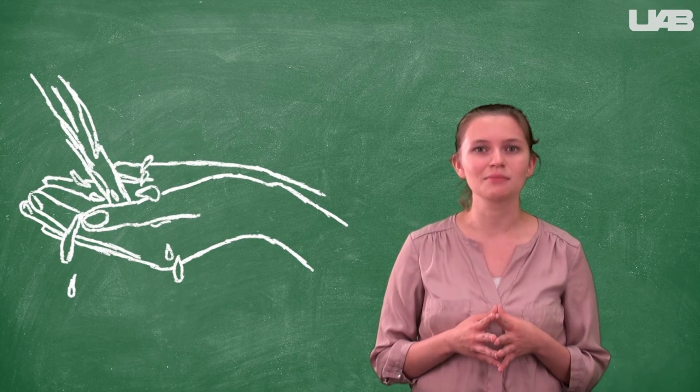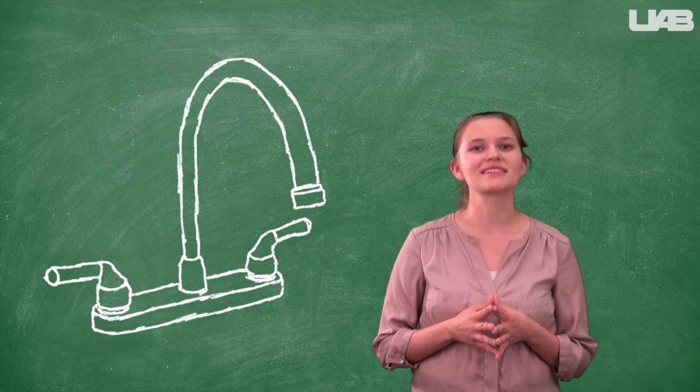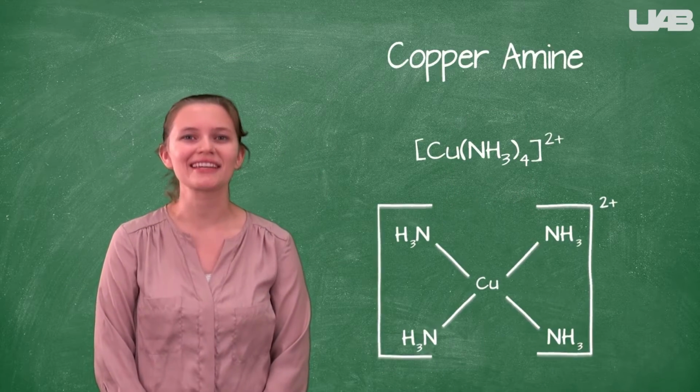At the end of the lab, you can pour all the solutions down the sink to clean up. As always, it is a good idea to wash your hands at the end of the lab. Okay, so now we're ready to get started.